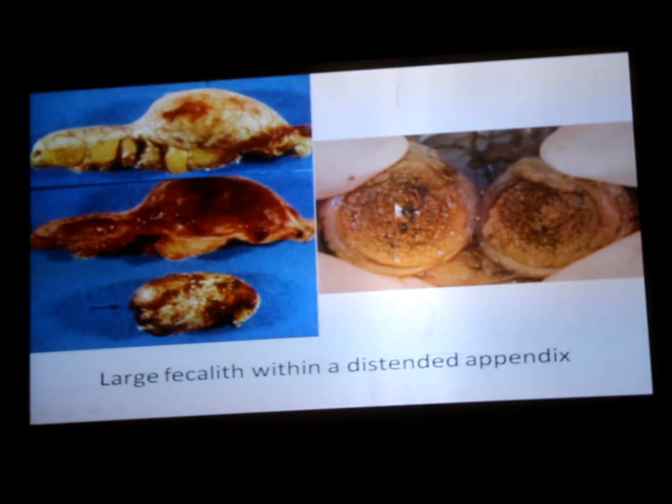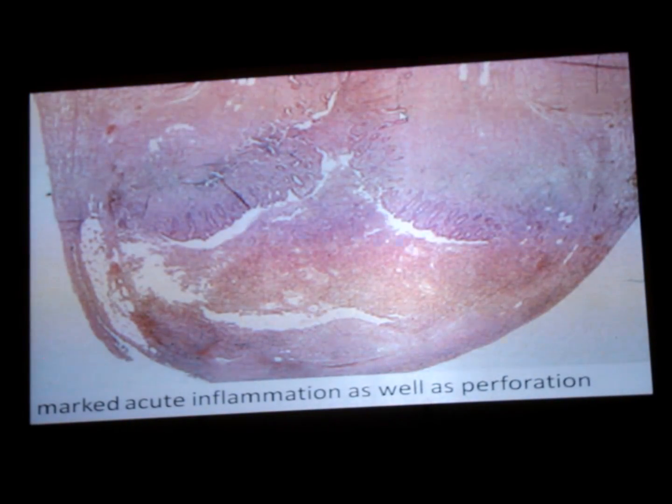There can be many more causes. So this appendix was inflamed, it was removed. This is another picture, cut section, where because of fecal matter, this is also completely blocked.